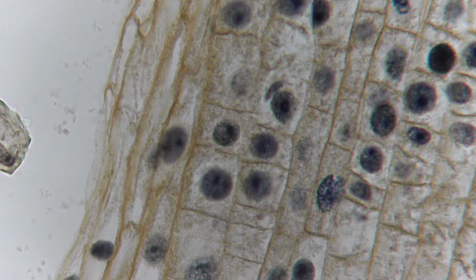All that grainy stuff just inside there, kind of pink looking, that's cytoplasm. The large round structure in each one is the nucleus, and we'll label that with a bracket. And then the actual lining that makes up the edge of it, the border, is the nuclear membrane. And all of that purple grainy stuff inside the nucleus is chromatin network. It's actually the chromosomes, but they're so stretched out, they're not distinguishable.